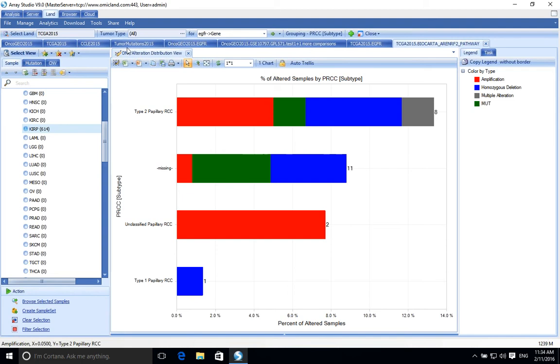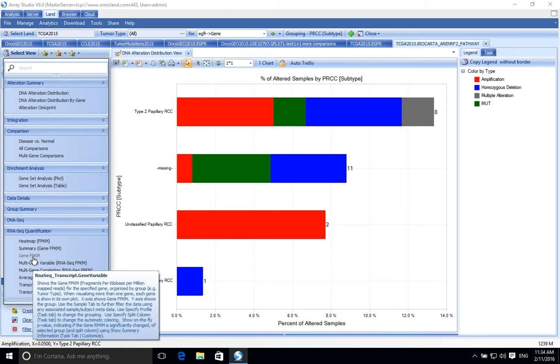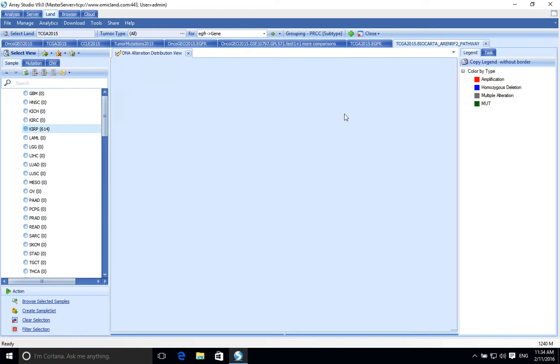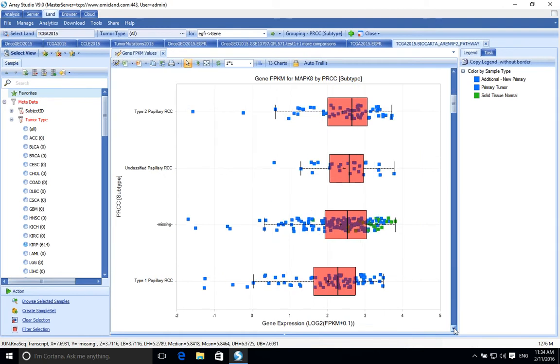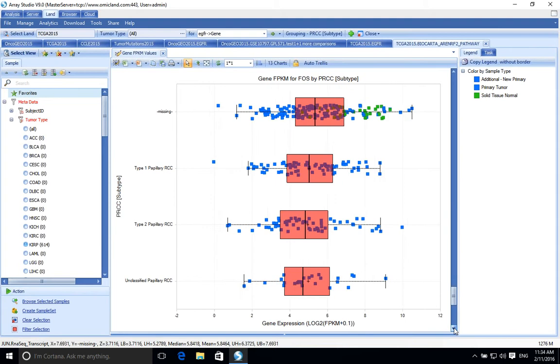As well, and then of course you can look at the expression data. You can look at any of the different visualizations using this column. And again, if there are papers that we haven't included that you'd like us to include, please let us know. So this is just your standard RNA-Seq expression patterns for these genes.